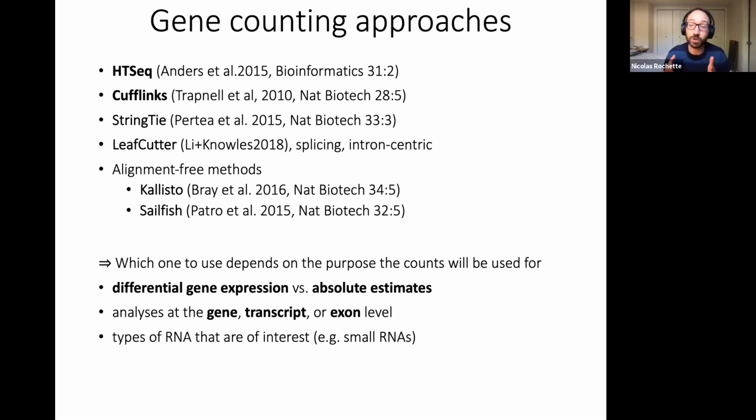Those small reads are only going to overlap one or maybe two exons. So figuring out the differences at the level of entire transcripts is going to be very difficult from these short reads. We can improve a little by using longer reads, maybe 2 times 150 base pairs, giving us a 300 base pair sequence, and then the paired-end insert may give us information about maybe 400 base pairs of sequence.